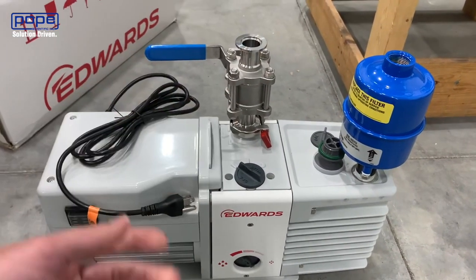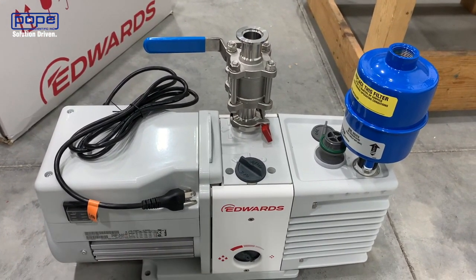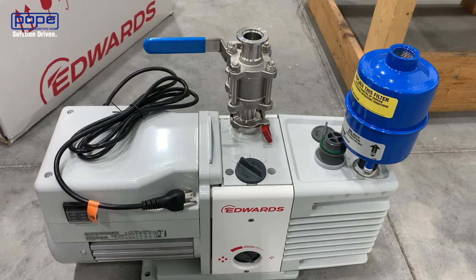When doing so, you won't necessarily see it, but you'll actually smell some of the odors coming out of your vacuum pump.